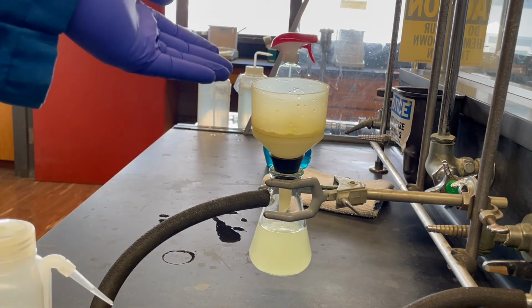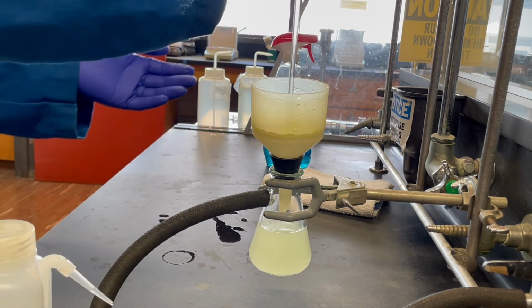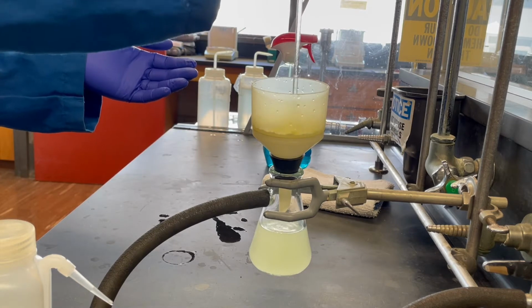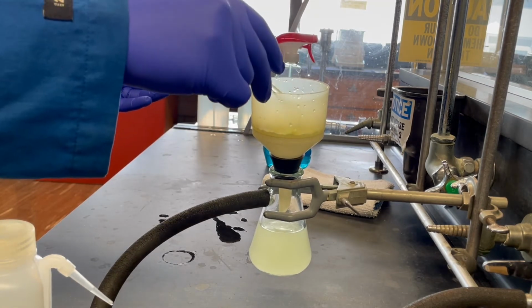Let that dry for like 10 minutes, occasionally maybe stirring and poking at it just to give it a little extra help to get dry.